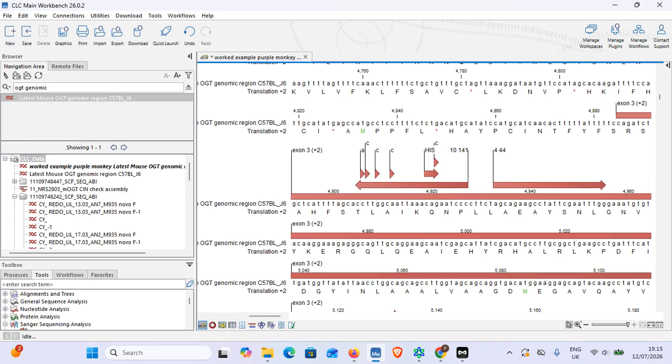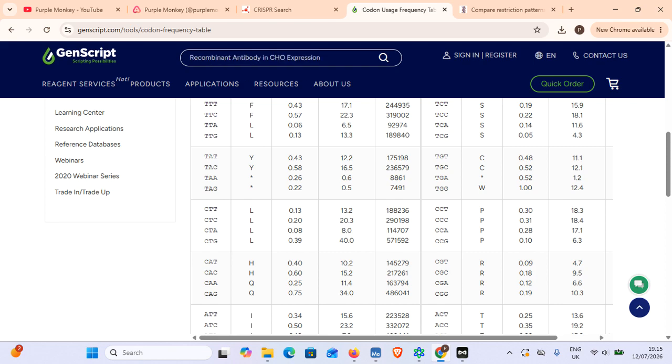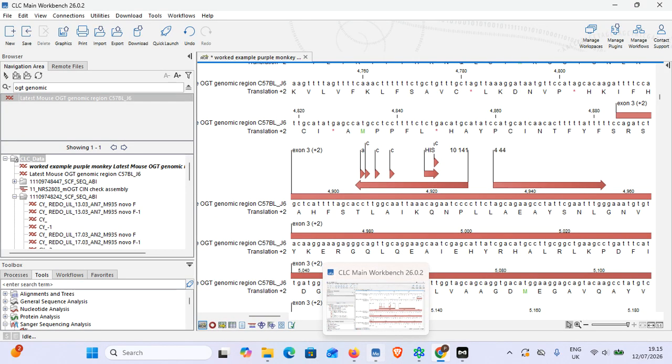CTG, no, but that also has the same end. We want something a bit different. So, CTC, that would do famously. Can we go any better than that? Oh, no. TTG. Now that is a twofer. Yes, it isn't the craziest popularity, but we get to kill two birds with one stone, which does have its charm.